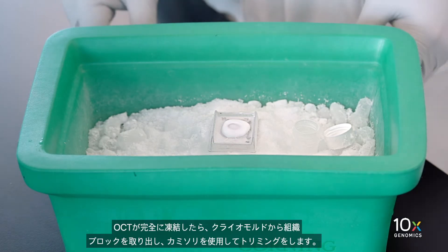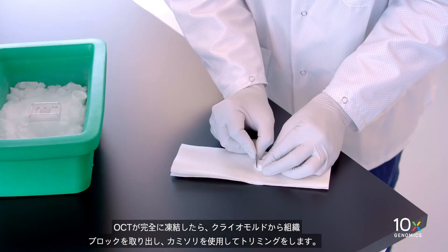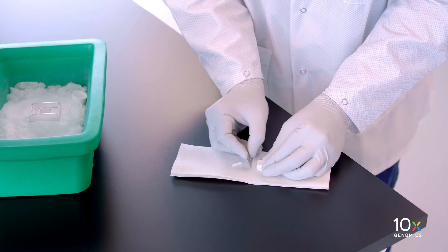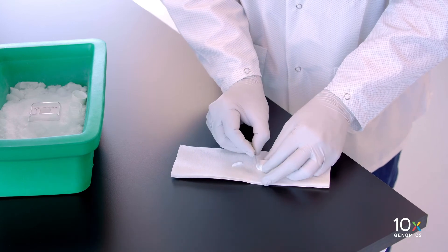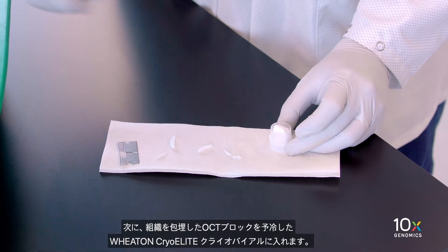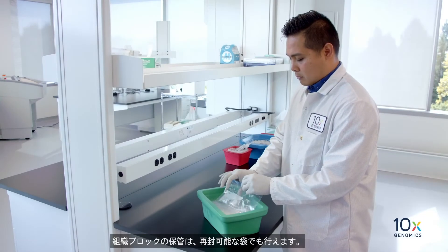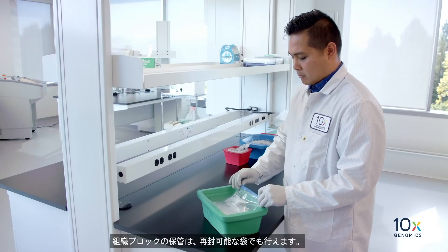Once the OCT is completely frozen, remove the tissue block from the cryo mold and trim it using a razor blade. Then place the OCT embedded tissue block into a pre-cooled Wheaton CryoELITE cryovial. Alternatively, a resealable bag can be used for storing the tissue block.